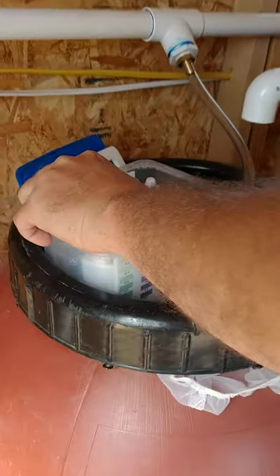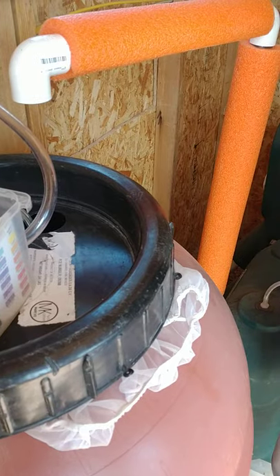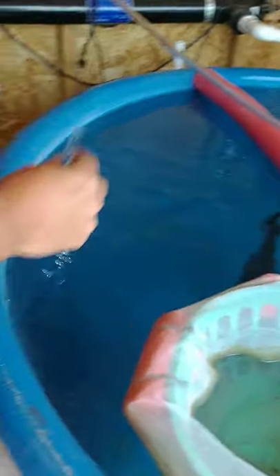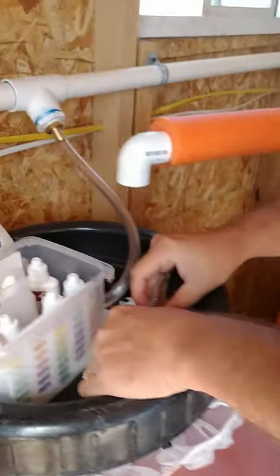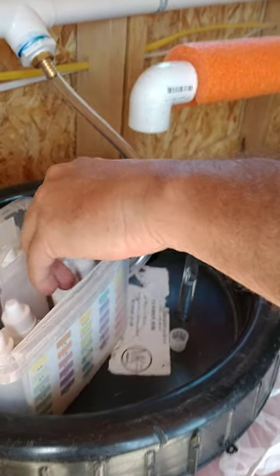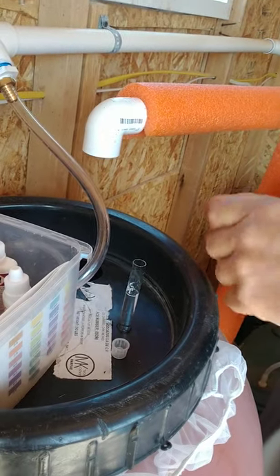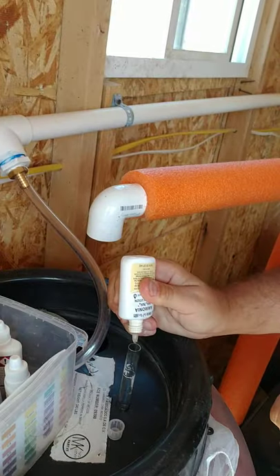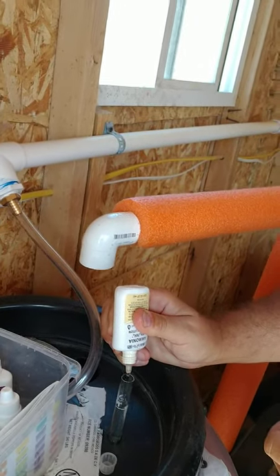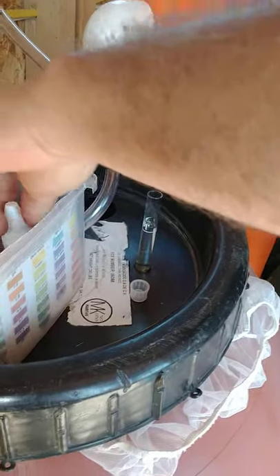Certain ones you have to do certain things to to get a good accurate count on it. So the first thing you want to do is your ammonia. Just give the bottle a little shake — not too crucial with these ones — and you're going to put eight drops in. This is going to give you an idea of what your ammonia levels are.